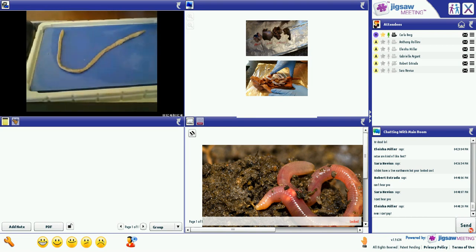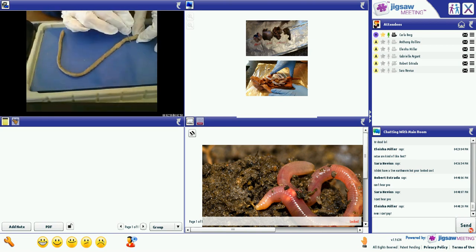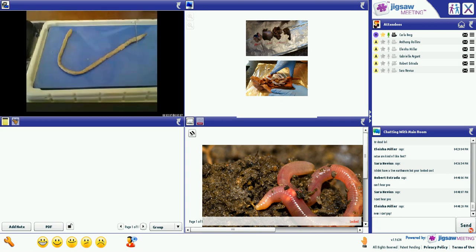So I'm going to take and open my dissecting tray. In your dissecting tray, you have little pins. I'm not going to actually pin my worm right now. What I'm going to do is take a pin and just kind of wedge it into my mat so that my worm stops rolling over. There we go. Everything that we are going to look at right now is in the top third of our worm. So it's from here to about here. So try to get that part in the middle of your tray.